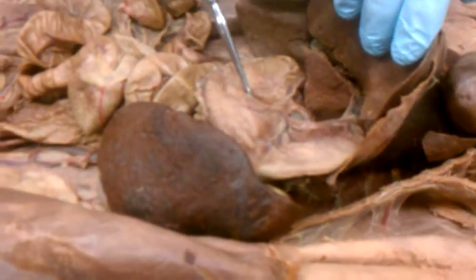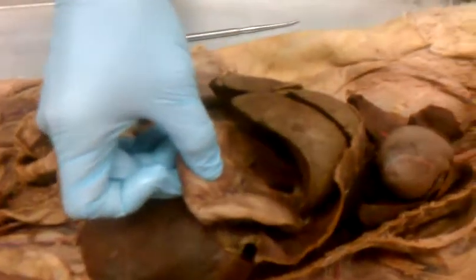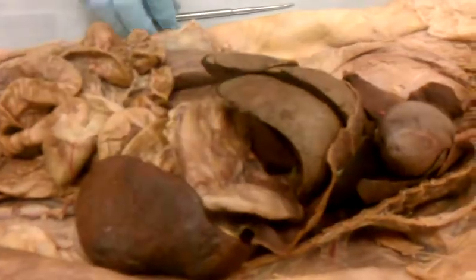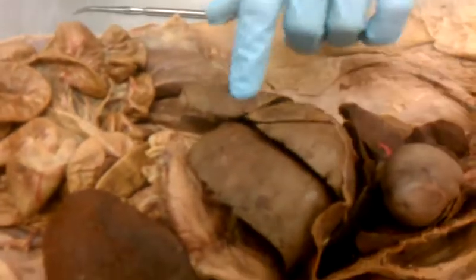Then you have your... How would you ask that on the practical? As far as putting a pin in the stomach and saying what glands are in here. Yeah, what glands are in there? The blue one. Then you have this organ. What is this organ? Liver. No, just kidding. This is the liver.